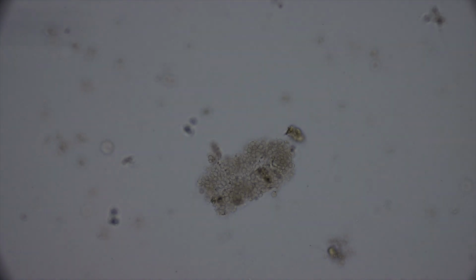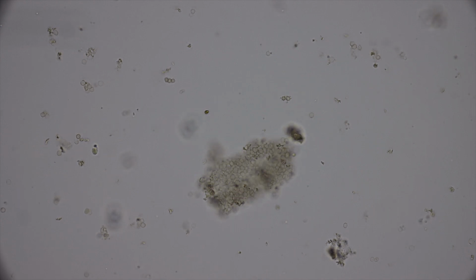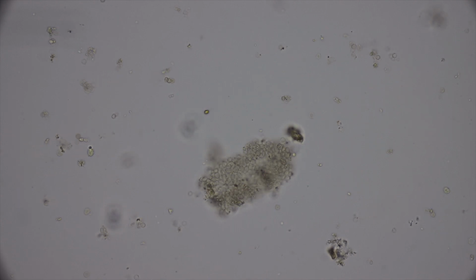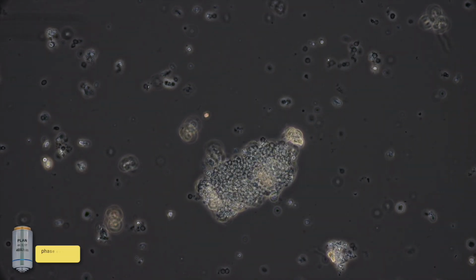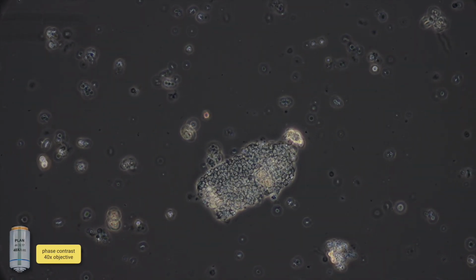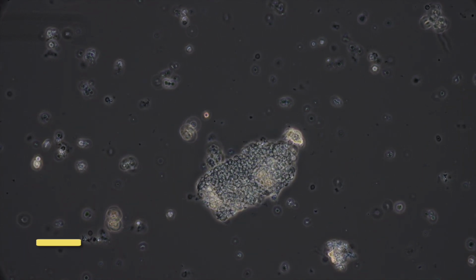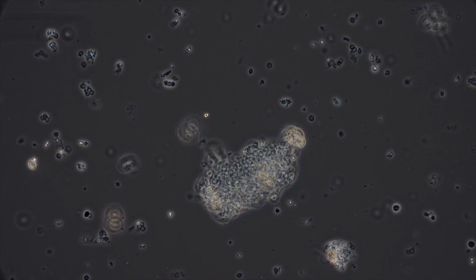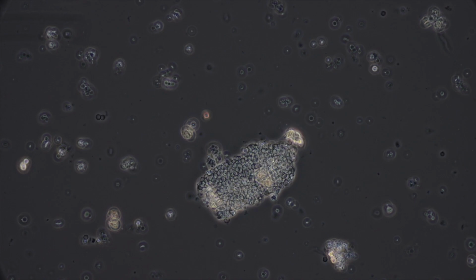We'll adjust the lighting. We see what looks like a red blood cell cast, but it looks like there may be some other cellular elements here. We'll focus up and down a little bit, and then we're going to change to phase contrast. Still with the 40x objective, you can clearly see the outline of the red blood cells. You can also see clearly some dysmorphic red blood cells in the background.